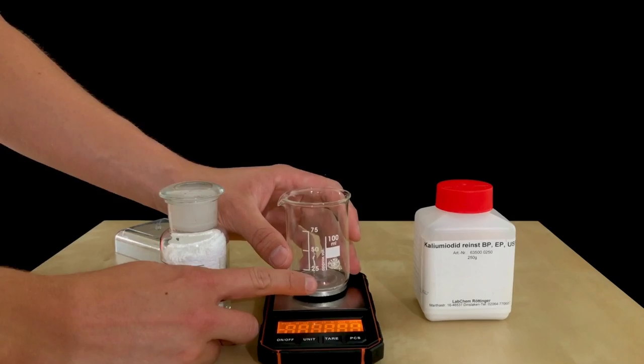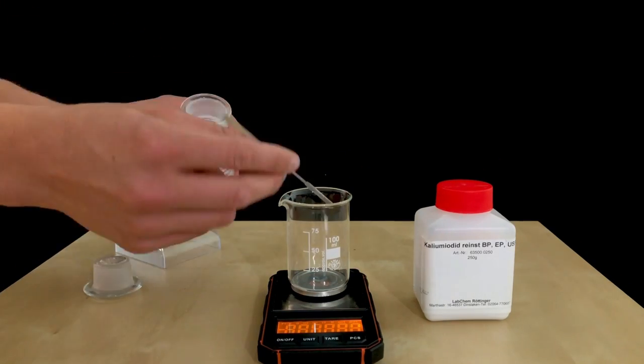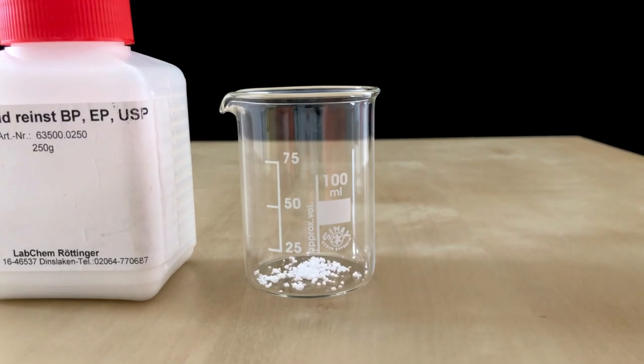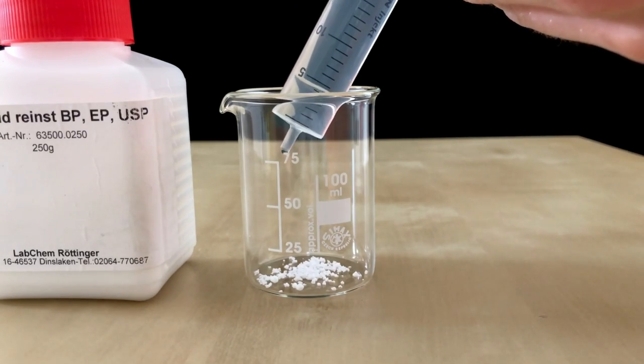We decided to start off by weighing out the 0.17 grams of bismuth oxynitrate. The next goal is to dissolve the bismuth oxynitrate in a solution of glacial acetic acid.